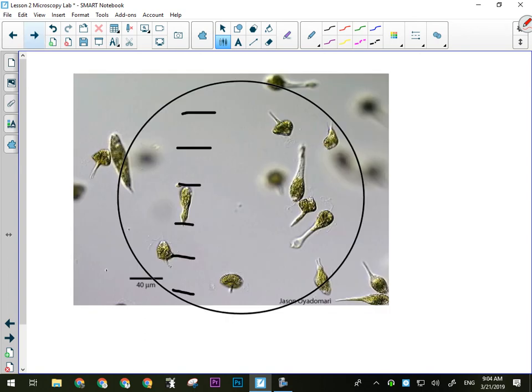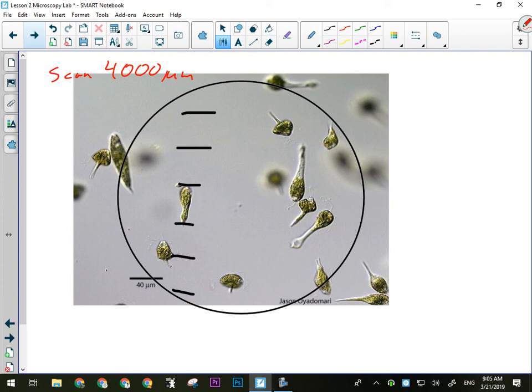Remember how we estimate the size of an object, because that's something you're going to need to make an estimate of when you do your drawing. We know the fields of view from yesterday. We know that the scanning power is 4,000 micrometers. And that's the one you'll use for the letter E. If you go any higher, if you go to the low power lens, you won't see all of the E. It'll blow it up too much. So take your picture on the scanning power for the letter E.